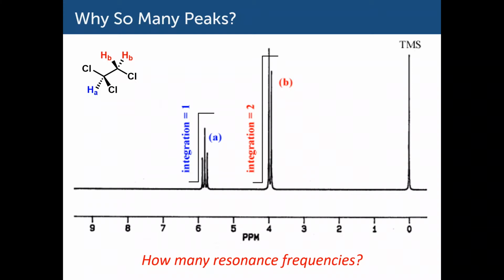Remember way back in the chemical shift video, we talked about these shifts as being relative to a reference. And that is the reference compound tetramethylsilane, or TMS. So that's really not from the compound that has the 3 chlorine atoms. It's distinct. We're going to focus on the two signals that are labeled with color.